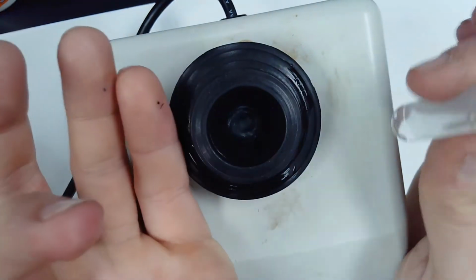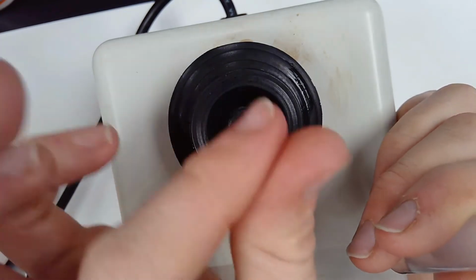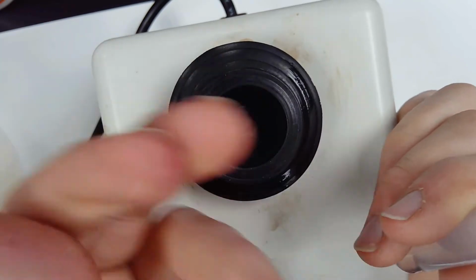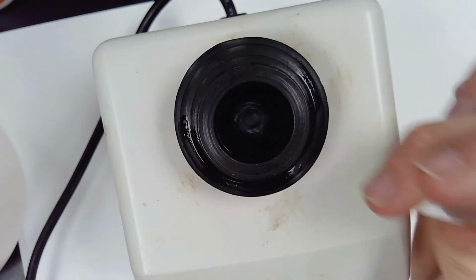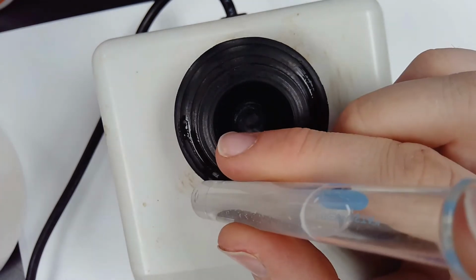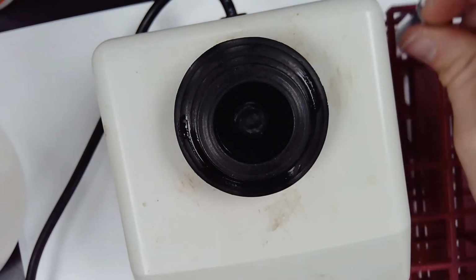Now, while we're here, I said this would turn my fingers to soap, and here it is. I've got some on my fingers, and I'm not going to panic. This is very weak, but I can feel my fingers a little bit slippery, kind of like there's soap on them, and that is the outermost part of my skin turning to soap there. Now, I'm going to quickly go wash my hands just because you never want to mess with those things too much. Bases are dangerous. But we now have our first solution, and I can keep it off to the side here and keep track of it. Number one is sodium hydroxide, and I've got a test tube.